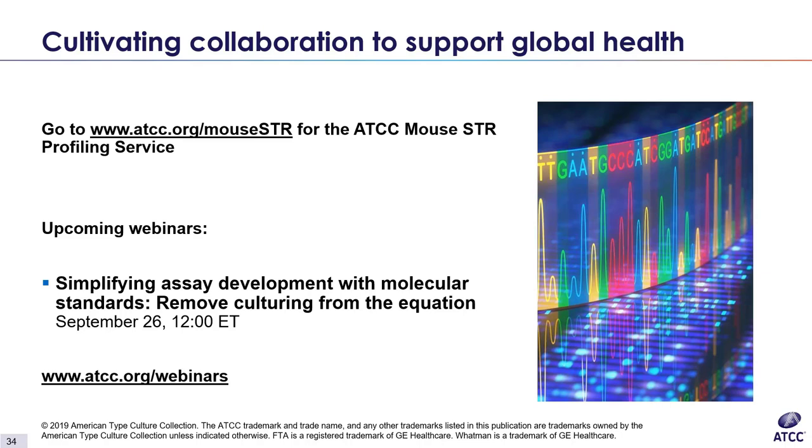Okay. Next one is for Brian. I've been working with a prostate tumor recently, and we found out that it lacked the Y variant of the amelogenin marker. How do you reconcile this? I apologize for the pronunciation. No, I think you got it, actually.